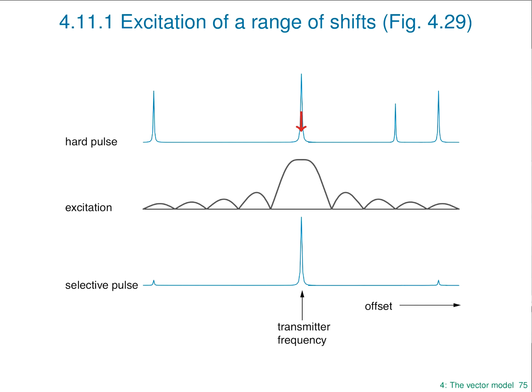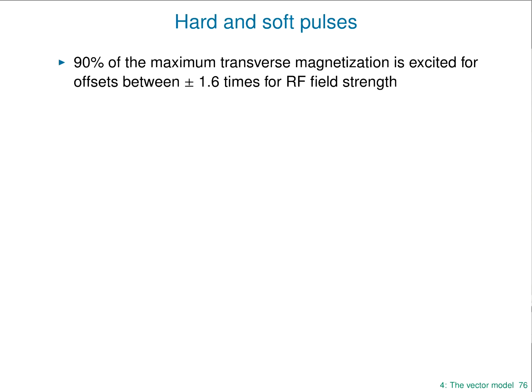And that turns out to be a very useful thing to be able to do in all sorts of experiments where you only want to excite certain resonances.